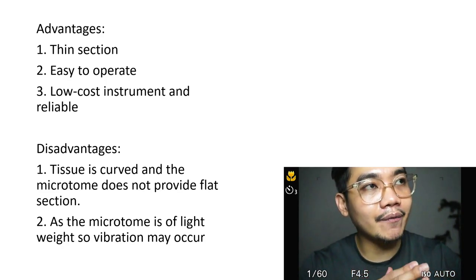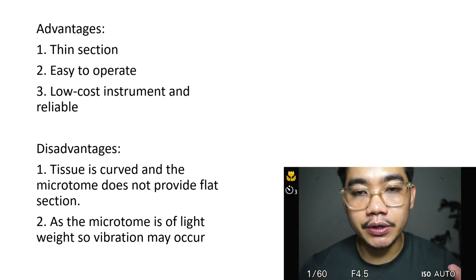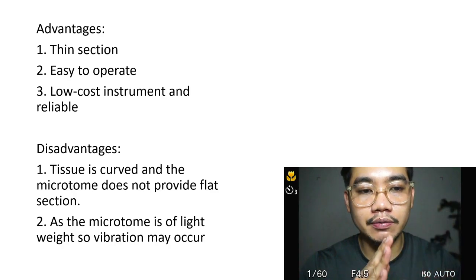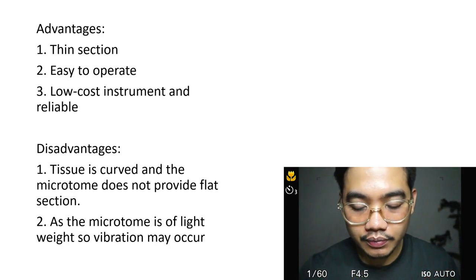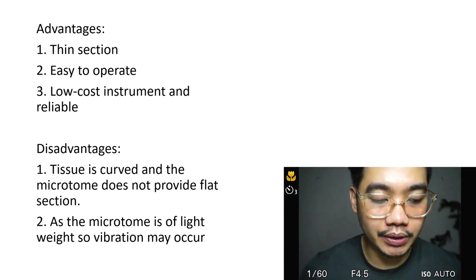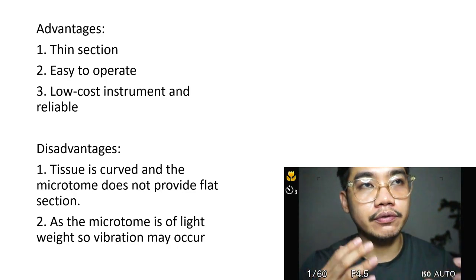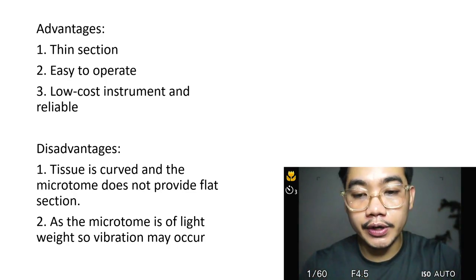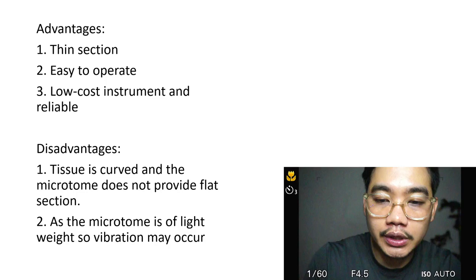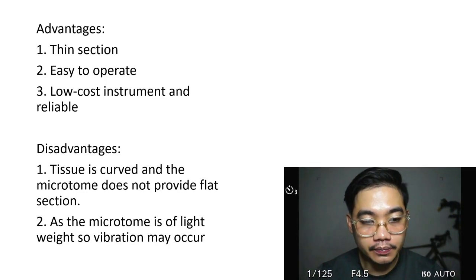But it is part of the preparation in microtomy that there are some parts, like the initial trim, that you really need to do so that the surface becomes even. You really need an even surface before you can collect the sections to be floated and put on a slide.